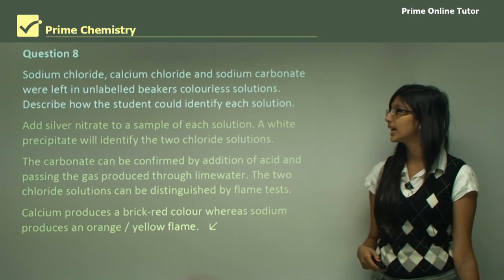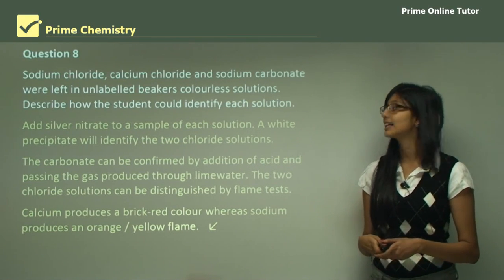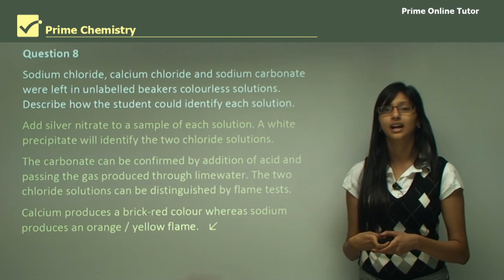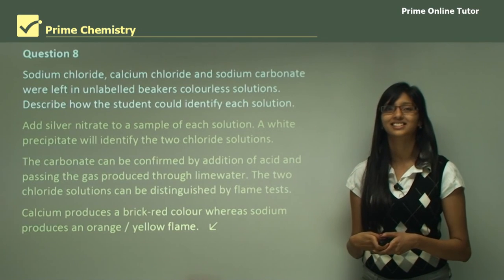This brings us to the end of the questions session, and in this investigation you looked at how different anions can be identified in your solution.